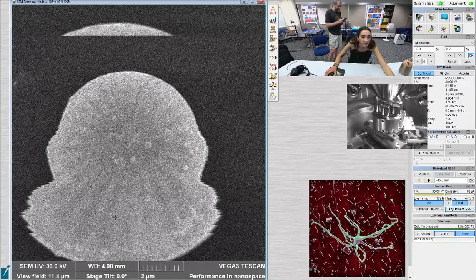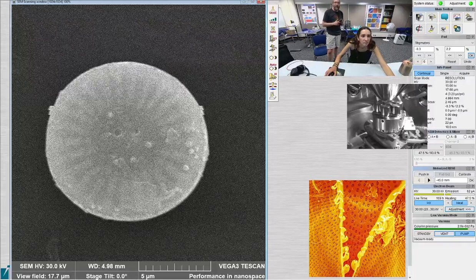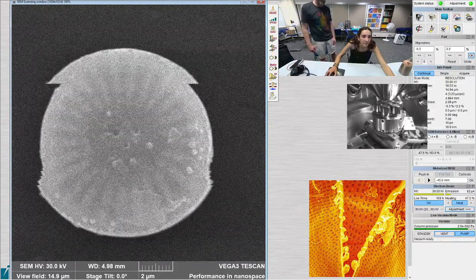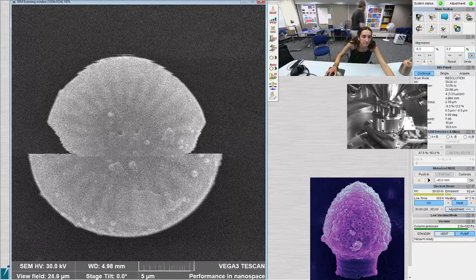This one's a really small one. Oh, yeah, that's the same one we were just looking at. I think that's just the outside view of it. And when they get smaller, they lose the transverse undulation.